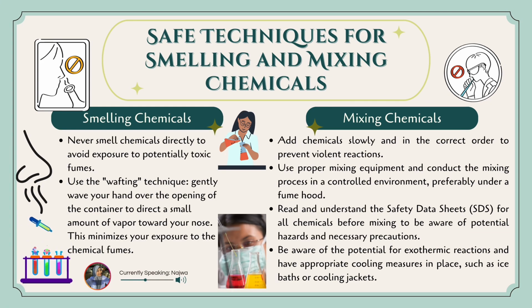When we smell chemicals, never smell chemicals directly to avoid exposure to potentially toxic fumes. Then, use the wafting technique. Gently waft your hands over the opening of the container to direct a small amount of vapor towards your nose. This minimizes your exposure to the chemical fumes.